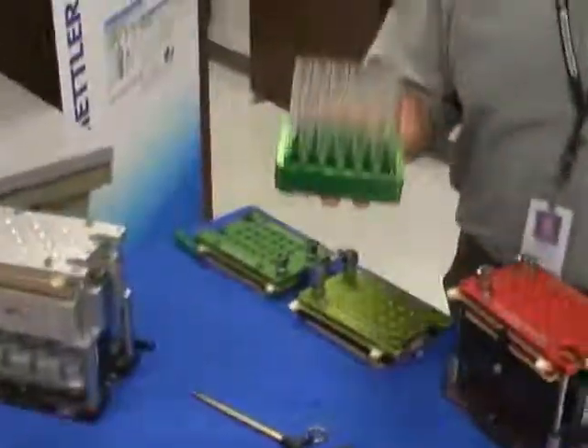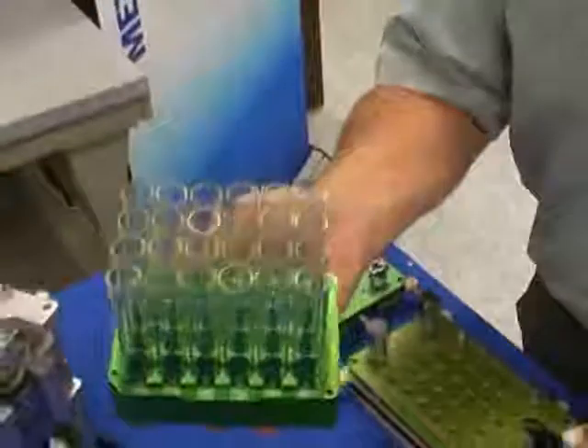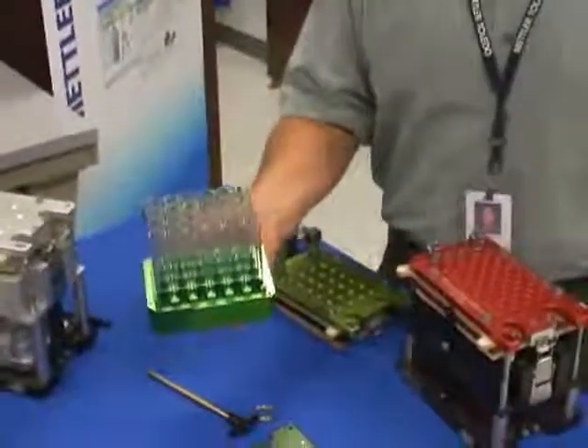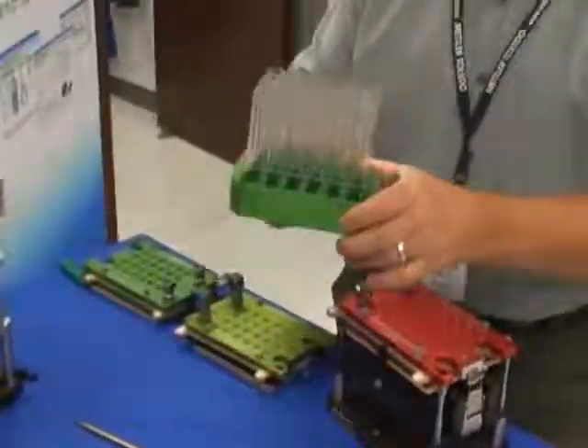One nice advantage of the smaller reaction vessels — the 24 and the 48 — is that a tray like this, full of 24 reaction vessels, can go directly into a parallel evaporator. This is very efficient because you don't have to move tubes around.